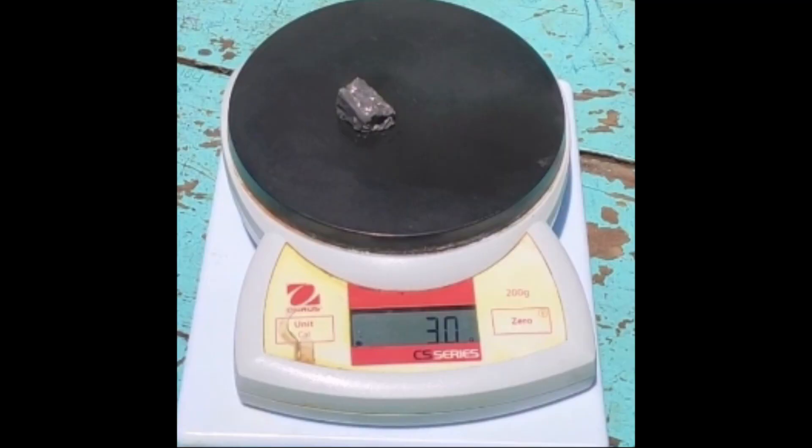And now, gentle ladies and gentlemen, for the very first time in a Kenyan high school laboratory — or any other laboratory in this country — 3 grams of potassium in water.